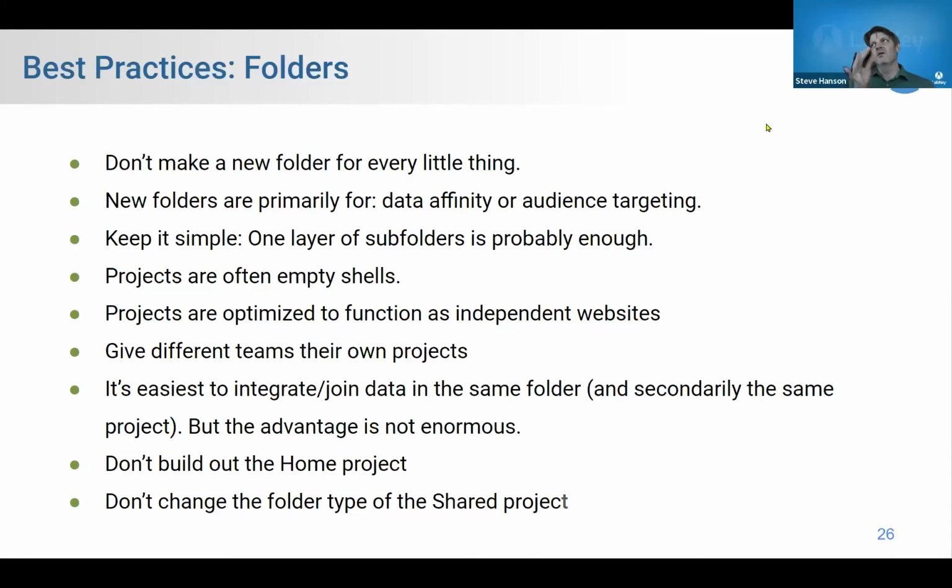Because in general, LabKey's security, although very wonderful, doesn't have a lot of granularity below the folder granularity. Now, don't take me totally at face value there. There are ways to achieve table level security, row level security, and we'll show how to do that, especially tomorrow. But in general, you should think that each folder is something that you're going to reveal as a whole to the world, including all of its content.